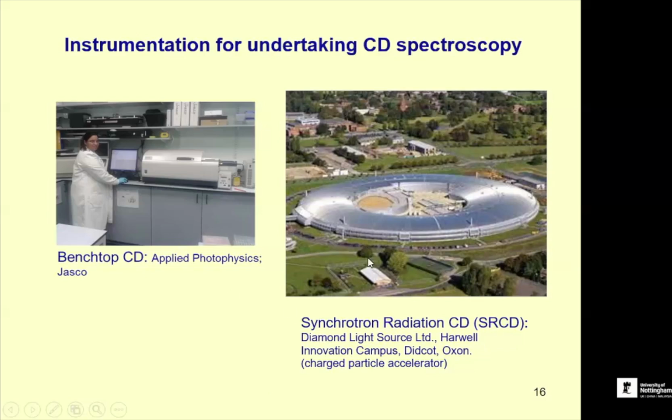But the synchrotron, as mentioned, has a higher photon flux, so it can deal with protein concentrations that are much lower than you would otherwise like, and you can get some good signal-to-noise ratios with very low concentrations of protein preps. So that's why I used the synchrotron for that purpose. But as I say, equally, they're much better at getting at these lower wavelengths for your carbohydrates.